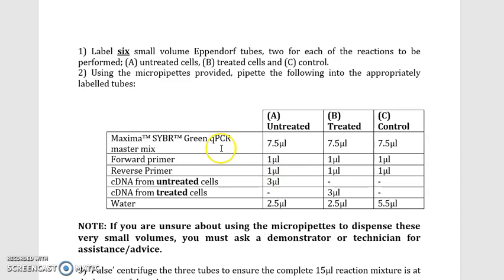because it is quite a sensitive experiment, right? Because we're using PCR. So it's going to bind to any genomic contaminants, it's going to bind to any cDNA if we have any, and it's also going to bind if the forward and reverse primers are complementary to each other, this is known as a primer-dimer. Now we would expect, obviously, in the lab that we are purchasing well-developed primers, so we sort of knew that we weren't going to have primer-dimer formation. But that's something to look out for.